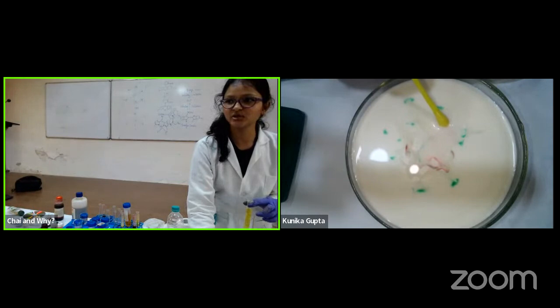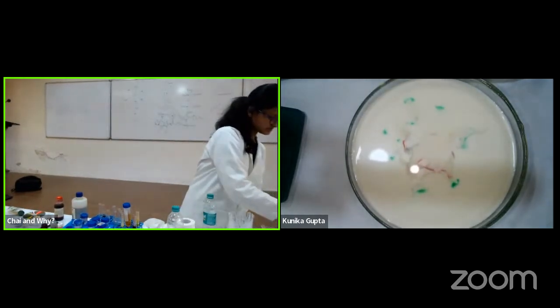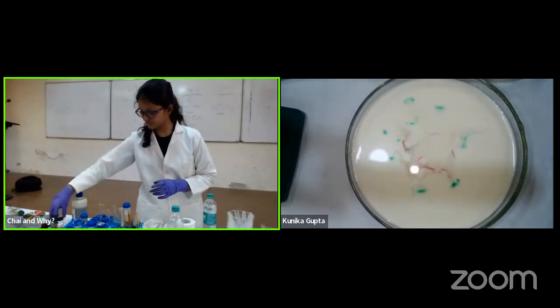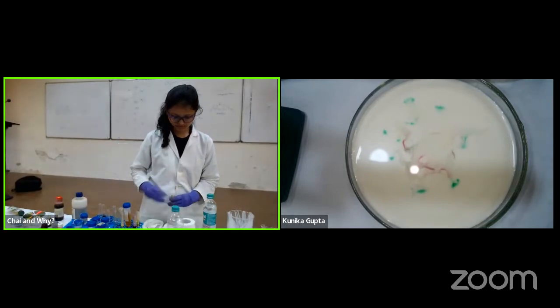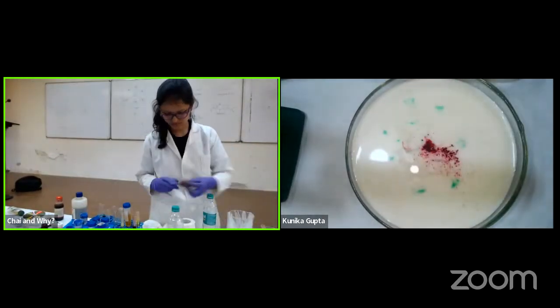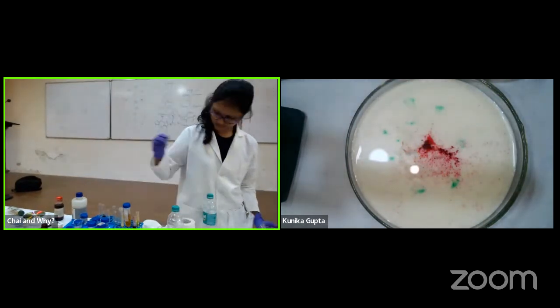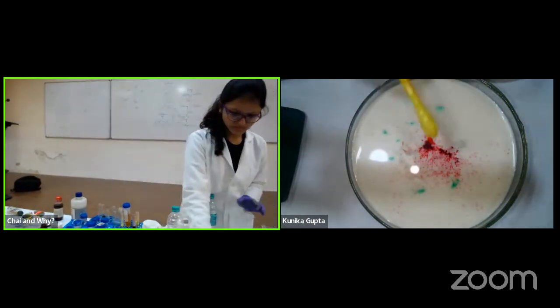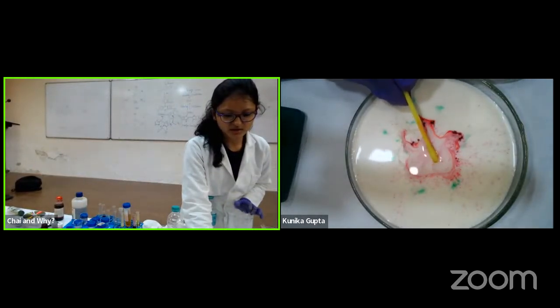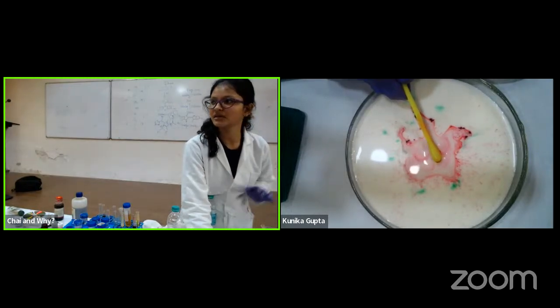So for you people, I think it's not visible, right? I can add more of the colors. Make a concentrated situation. Yeah. People here can come and watch it. Yeah. Come and see the thing. You can see that these colors are actually facing repulsion and they are moving far. Okay, so you can come here and see, audience.